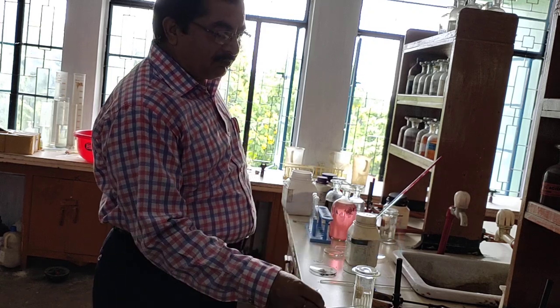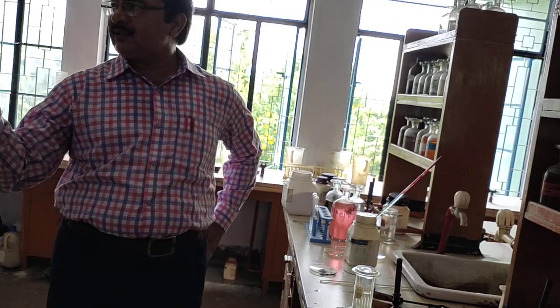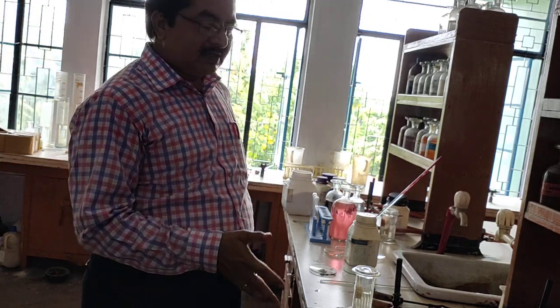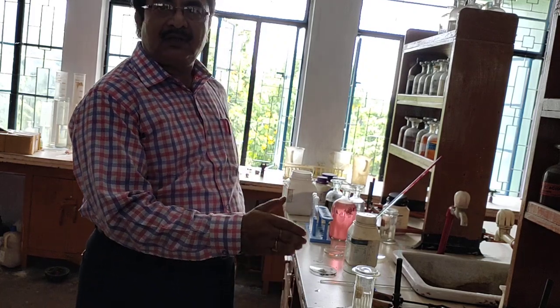So in this way we are getting the primary information of the salt by all these things, whatever general tests we have done, starting from the action of the charcoal cavity, cobalt nitrate, flame test, and borax bead test we are not doing because I have told you borax bead test we are doing for colored salt.